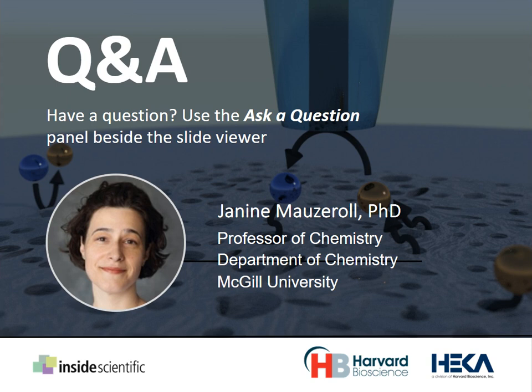Well, so the key in substrate generation tip collection mode is to choose your redox reporter molecule really carefully, and make sure that they're not in the same potential regime where they could contribute current. So it's when you start the design of your experiment, let's say you're going to carry out a reduction of oxygen, and you're using a reporter molecule, well, maybe ruthenium chloride isn't the best choice because it could overlap with it. And so it's important to choose your redox indicators correctly, because in substrate generation tip collection mode, you'll still want to approach the surface pretty close before you carry out the measurement.